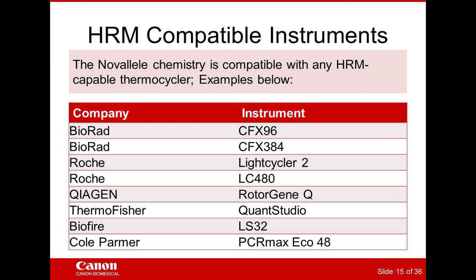So we do a bulk of our development work on the Bio-Rad CFX systems in-house. We've done cross-platform testing on Roche systems, so the various LightCyclers, the LightCycler 2 or the LC480. QIAGEN has a system that we do testing on, the Rotor-Gene Q. Thermo Fisher with the QuantStudio has a melting module that you can add. BioFire has an older system, the LS32, and the Cole-Parmer Eco48. So we've seen similar data across all these systems.